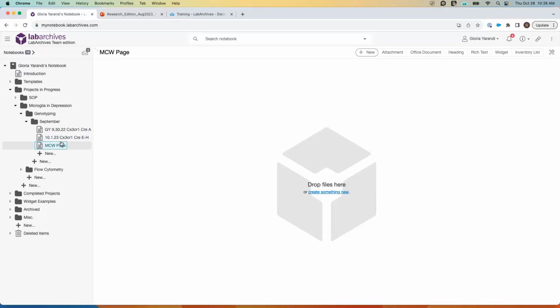So let's go back to our MCW page that we created earlier, and now let's discuss how you can add data to your notebook. But before I do that, I'm going to take a quick pause for anyone who has questions on what we talked about so far.